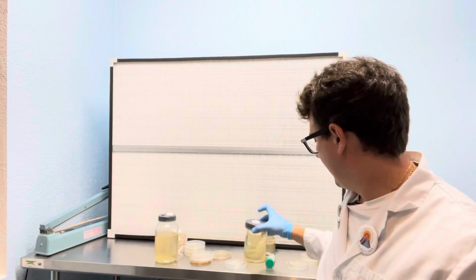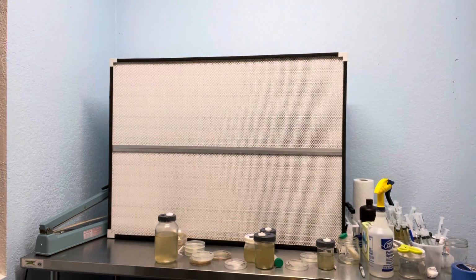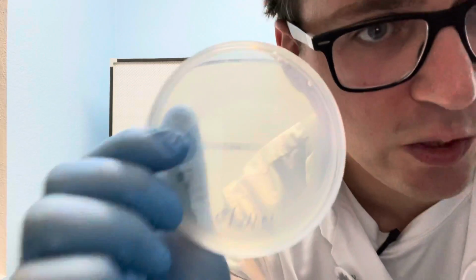I might have one right here, and it would look alright. So yeah, you can see it's very spindly and fast growing. This is actually after 2 days growth. It's a Morchella importuna, which we're going to be planting for fall.